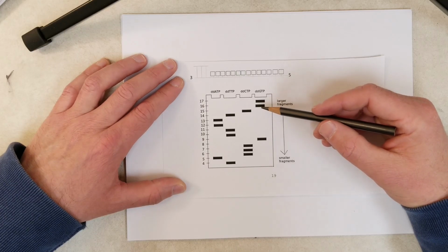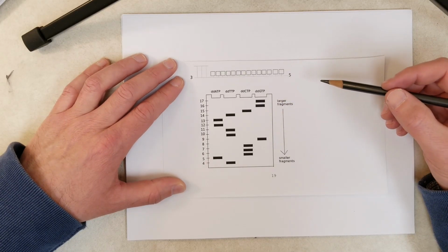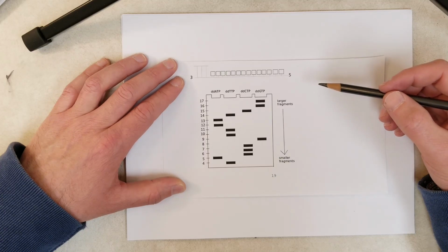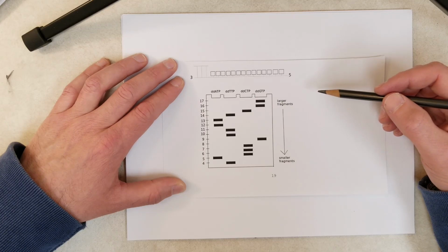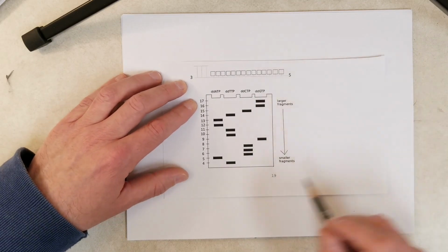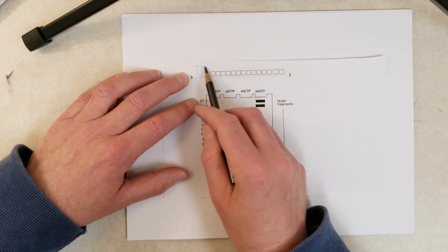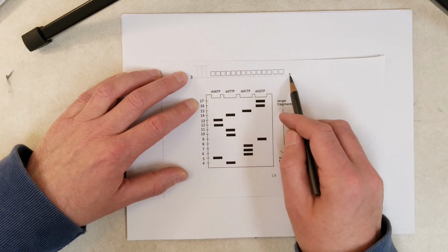Here's our Sanger sequencing result, a gel from a Sanger sequencing assay, and I asked you to determine the sequence of the non-template strand, what would you do? Okay, well, I'll show you what you would do. You take the gel right here. Okay, we have this little diagram set up to make it easy.